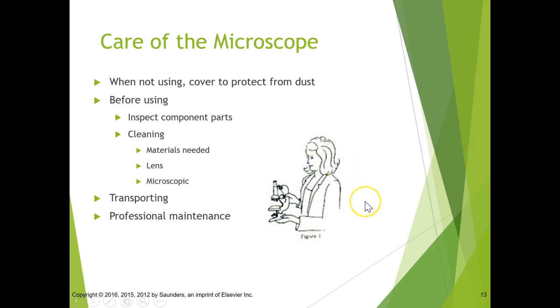Before we use it, we want to inspect it. Make sure it's clean. We want to transport it as this lady shown here. You want to hold a hand under the base and one on the neck and the back. Be very, very careful when transporting. You do not want to drop something this expensive.